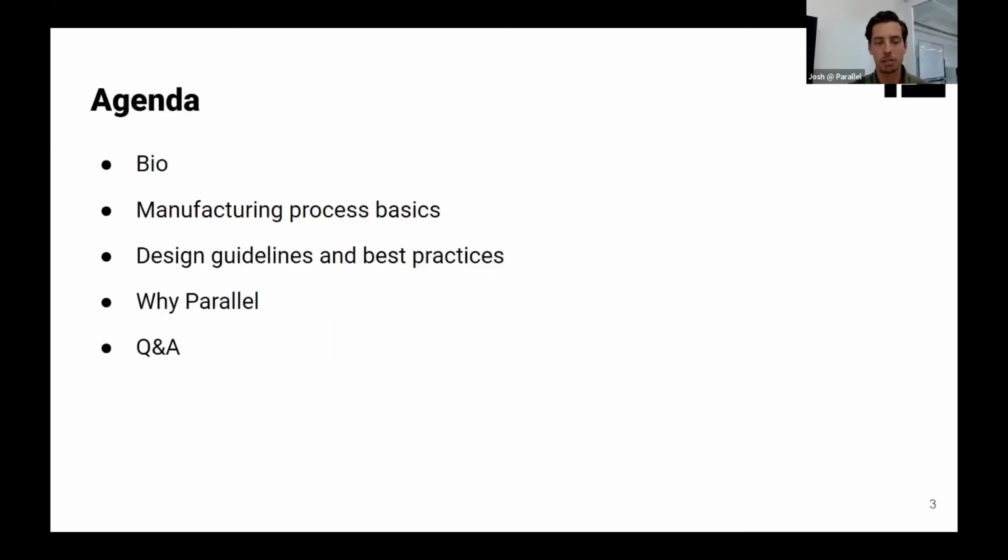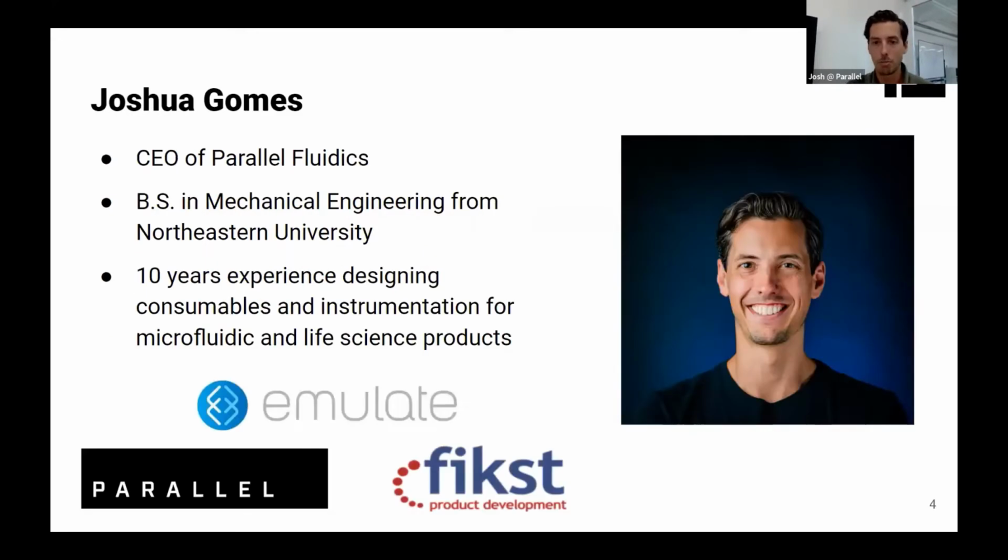So the quick agenda for today is I'll talk quickly about my background. I won't bore you with that for too long. We'll talk a bit about manufacturing processes at a high level for microfluidic devices, and then jump into some real nitty-gritty design guidelines and best practices to really improve your chances for success. And then we'll wrap up with just a quick bit about our work here at Parallel, and then the question and answers session.